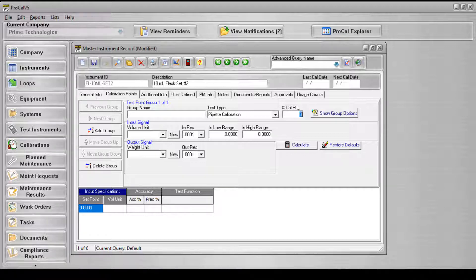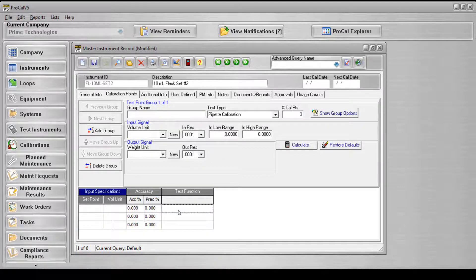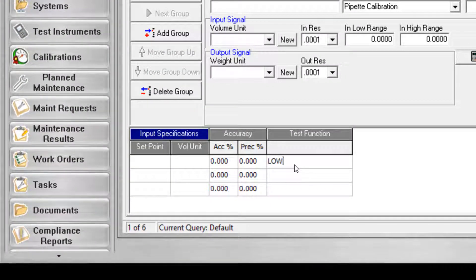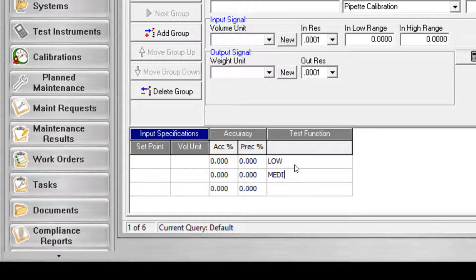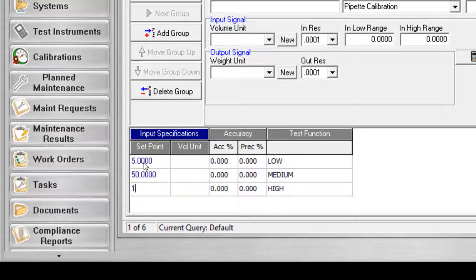Here, you can see that the number of calibration points is set to 3 and the test function column has been manually populated with low, medium, and high. The set point and accuracy rows must also be filled in manually.